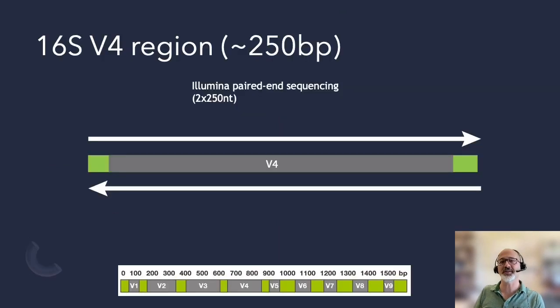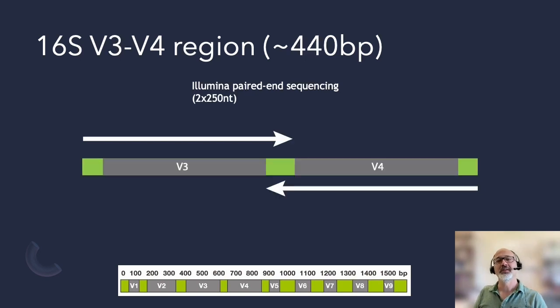To use as an example of some of the things we have to deal with, 16S has a number of different combinations of primer pairs, which illustrates some of the issues that we run into with Illumina paired end sequencing. So the simplest one is V4, the most common, where the reads completely overlap with 2x250 reads that you would get off of an Illumina MiSeq or an Illumina NovaSeq using one of the smaller lanes. So you can actually imagine that these will completely overlap. The reads can somewhat self-correct for one another, and you can get really good read pairs combined from this, but the information that you have in that region is fairly low. So you may want to jump to getting more information from additional variable regions.